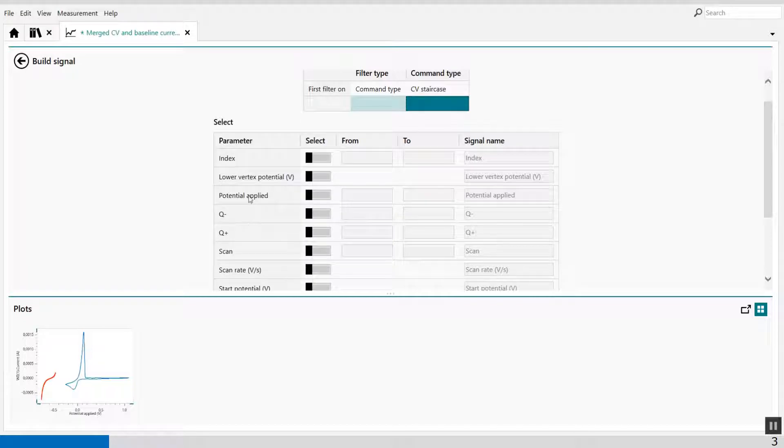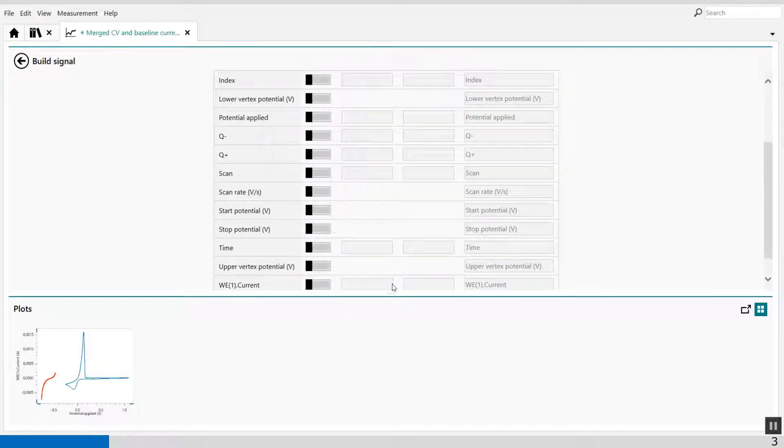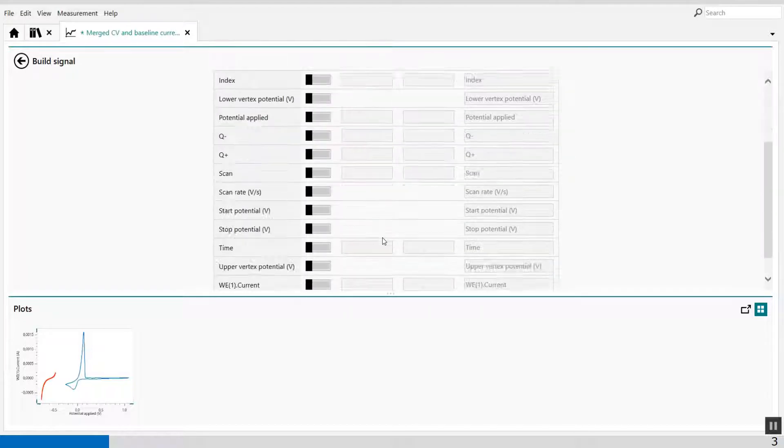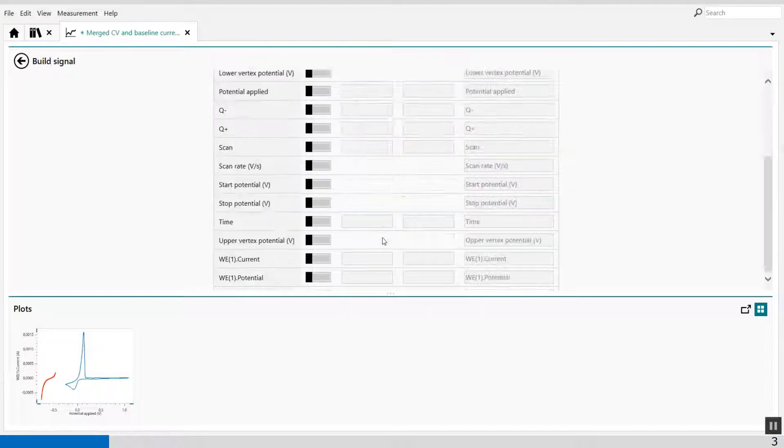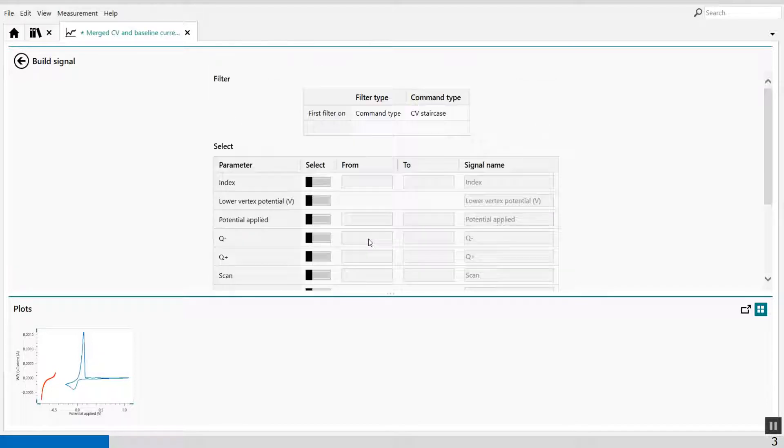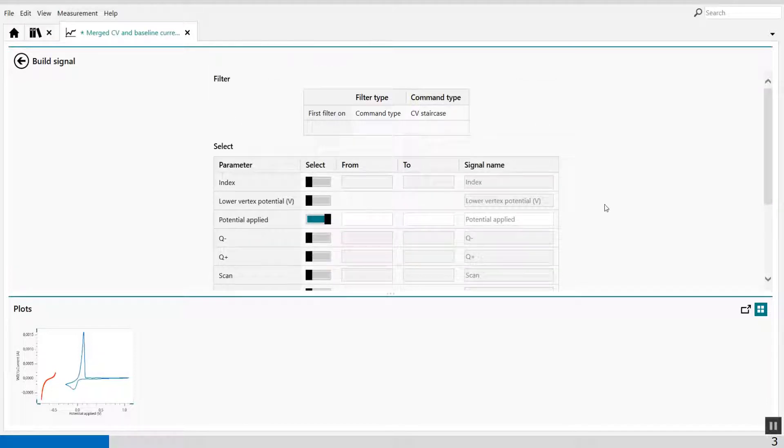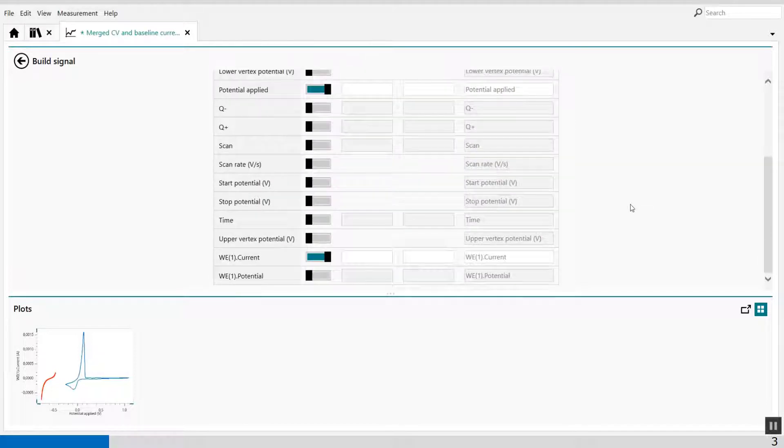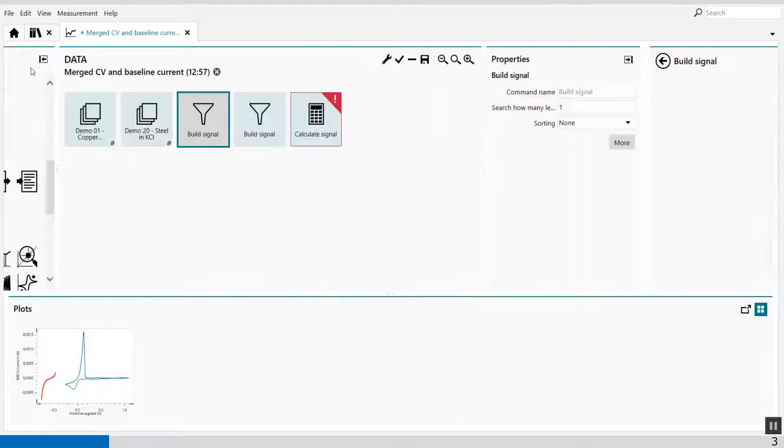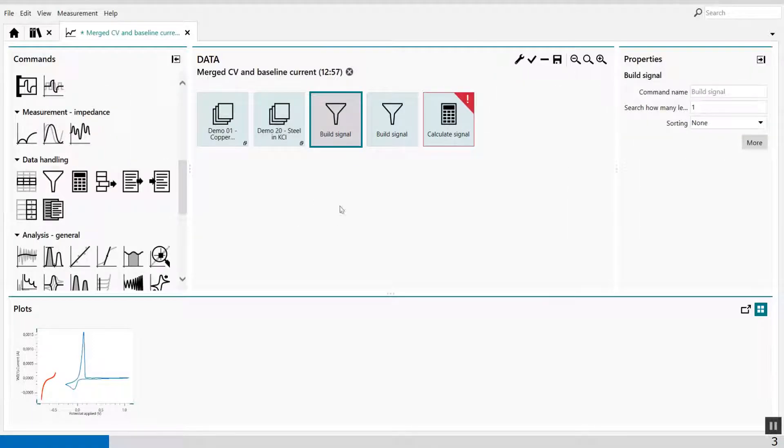I select CV staircase. And when I press enter, I have my values of my CV staircase available. Well, I'm interested in the current measured, but I'm also interested in the potential applied. So these values are extracted. That's one.